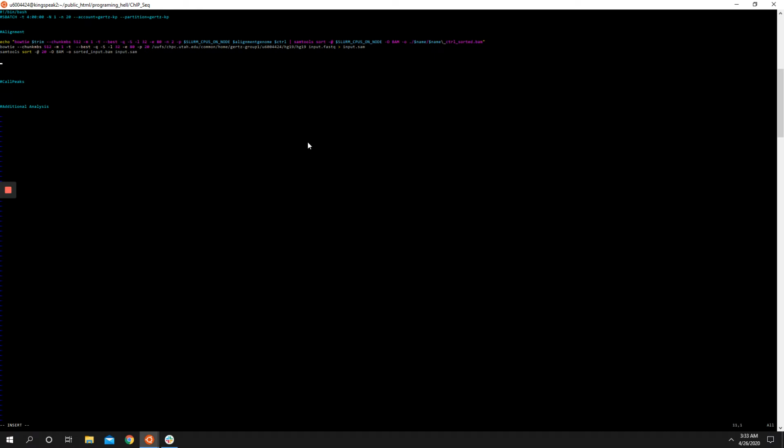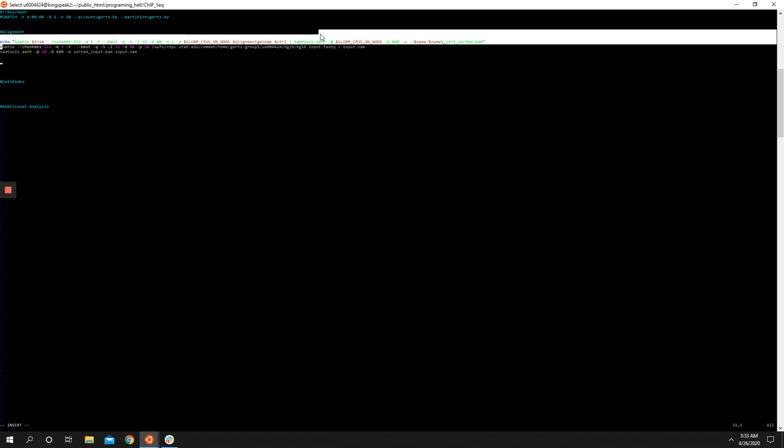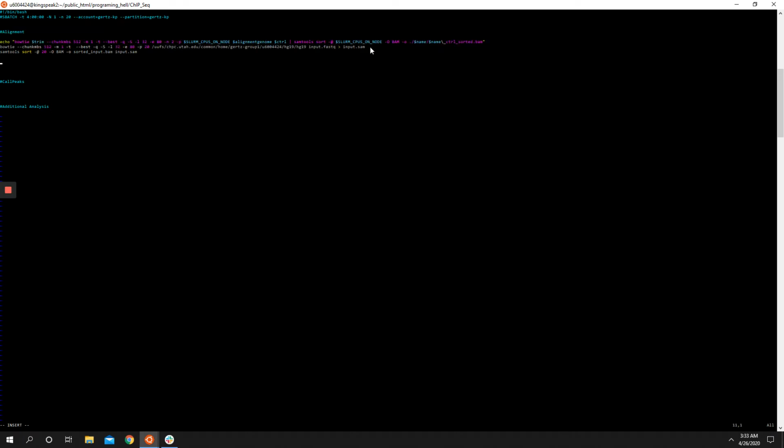And then we would have done this whole thing over again for our experimental one. So to save ourselves the time of typing this all out, we're just going to put in these two lines. And the only thing you would change is to call this experiment.